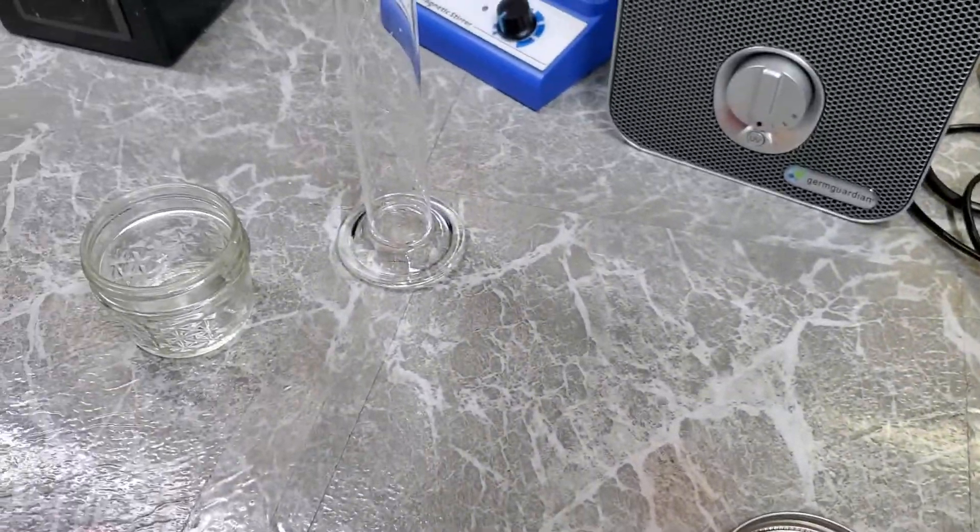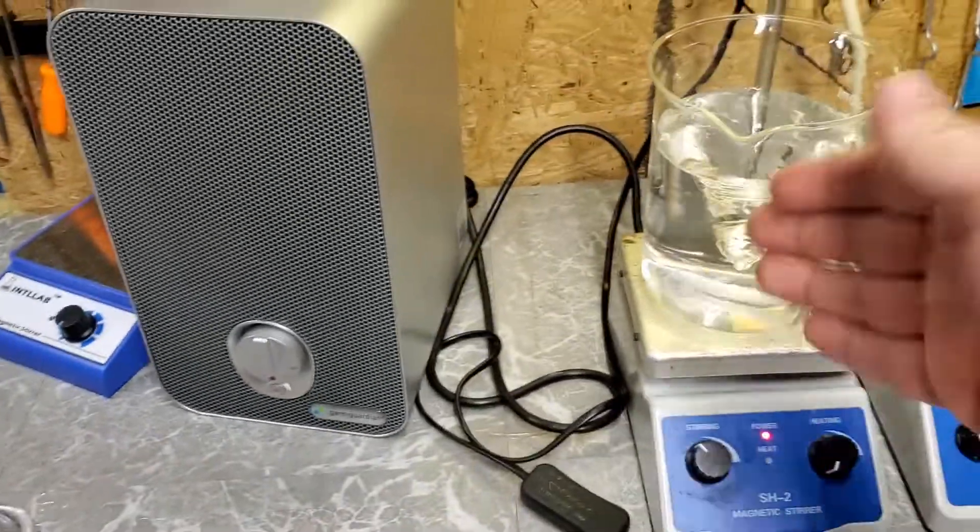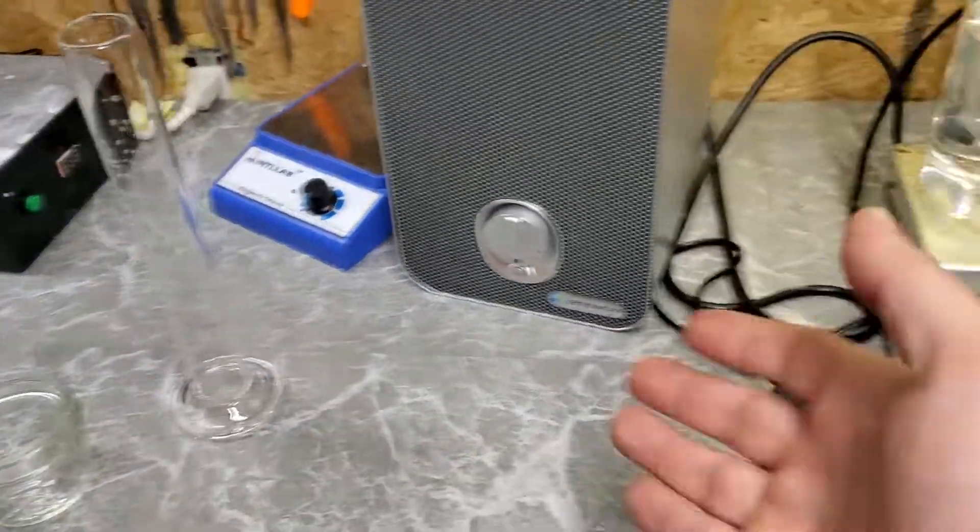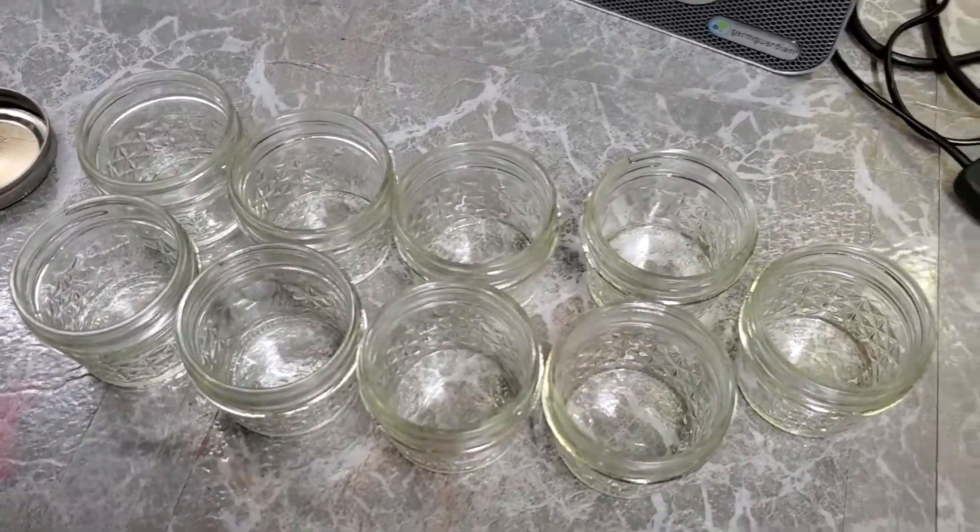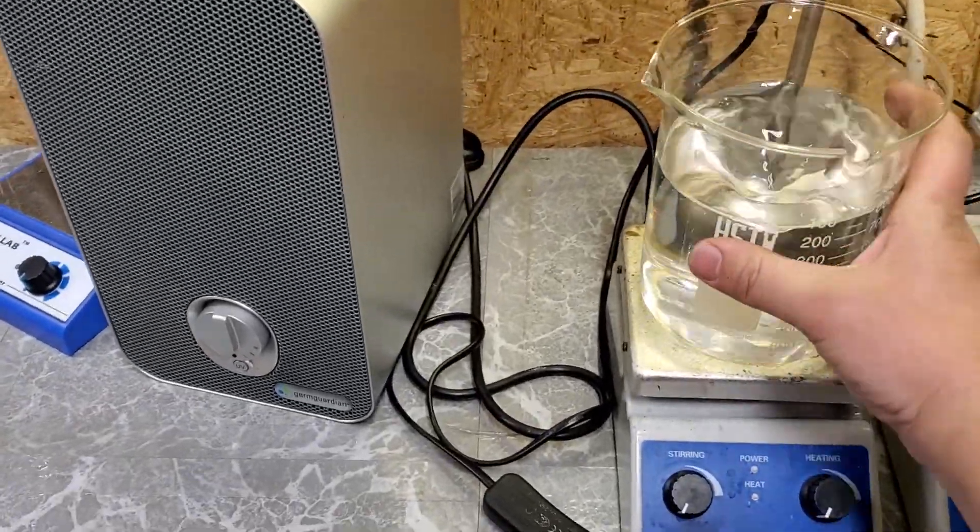Okay. Now all we have to do is just divvy this up between nine of these. So let's do it. Got all nine of them laid out here. Let me turn off stirring. I don't need that.